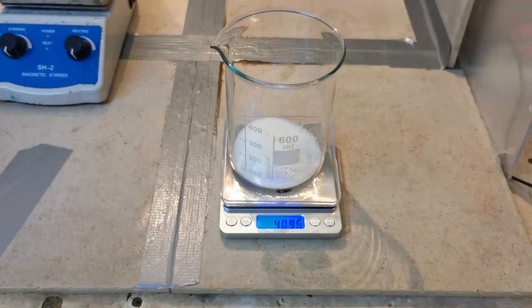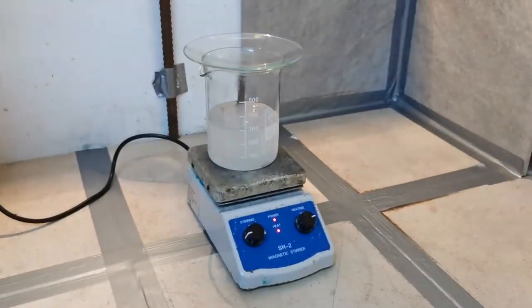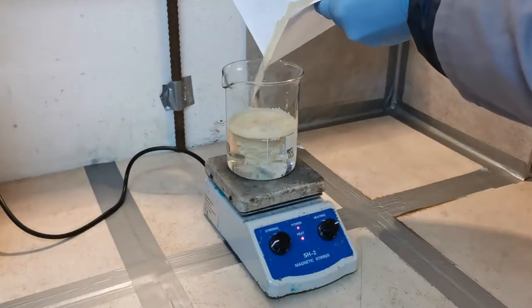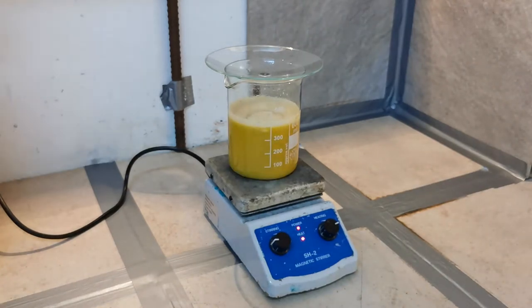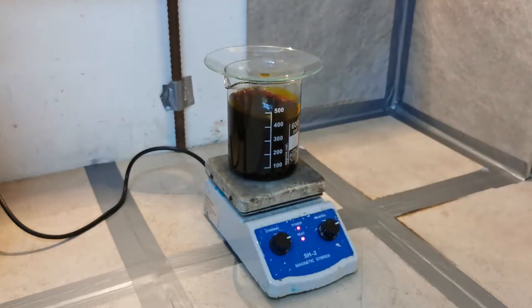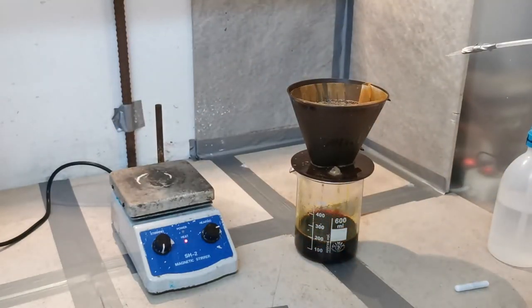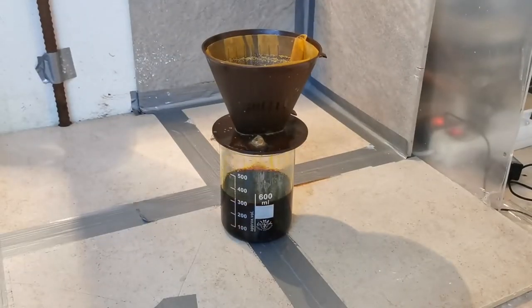After dissolving the sodium hydroxide, I added the sulfur and left it stirring under heat for about 30 minutes. As you can see, the color changed to a dark red and the liquid should become crystal clear. The last few flakes of sulfur were filtered out and the solution was ready. The amount of water used also isn't too critical, but keep in mind that upon cooling you may crystallize the polysulfides out if the solution is too concentrated.